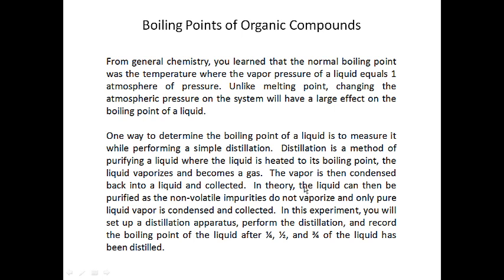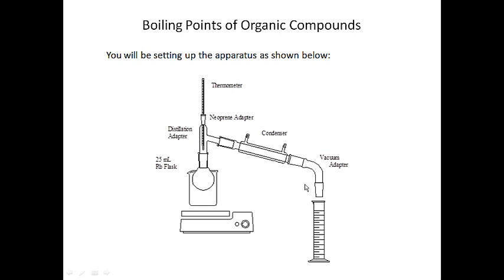And the way that this works is that we set up a simple distillation apparatus, and there's a separate video where I take you step by step through setting up the simple distillation apparatus. And in the lab, you'll go through this. The TAs or I will demonstrate, and you'll watch how we do that. But there is a separate videotape on this.